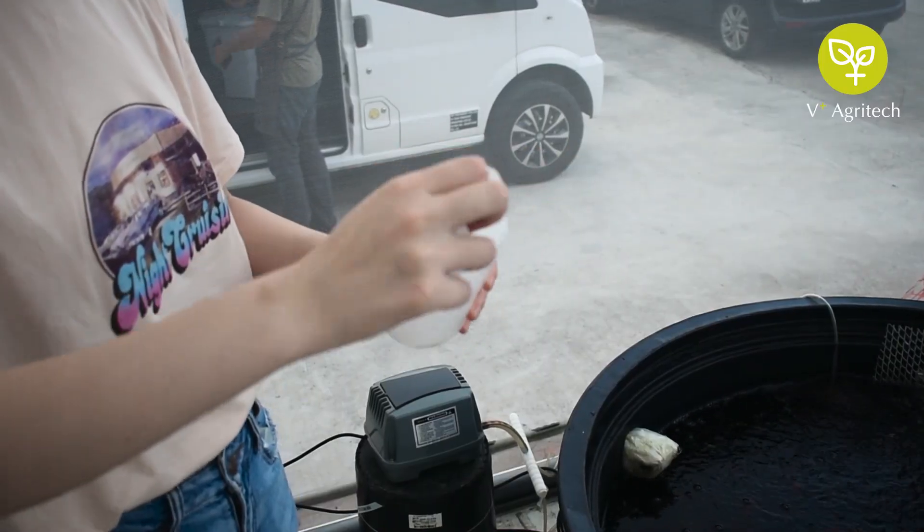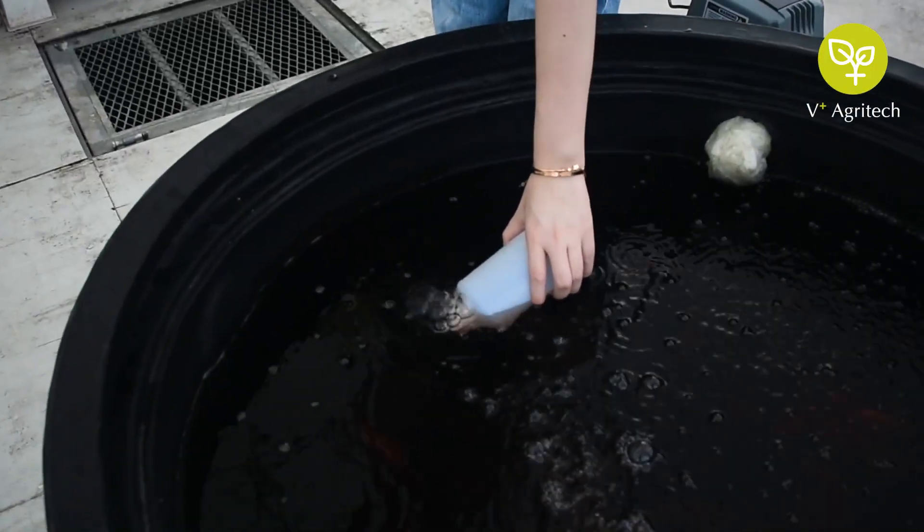Now, collect one litre of water sample into the provided water bottles.